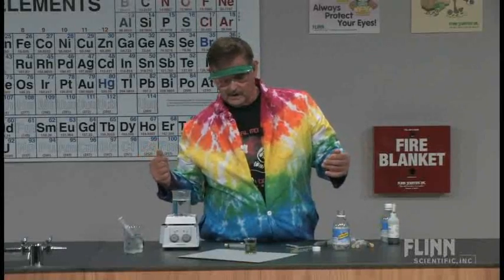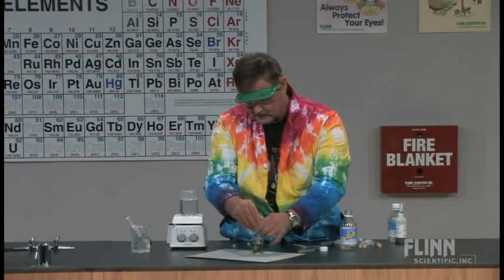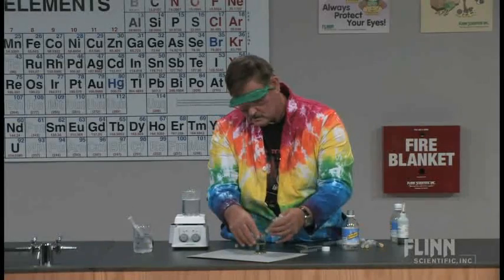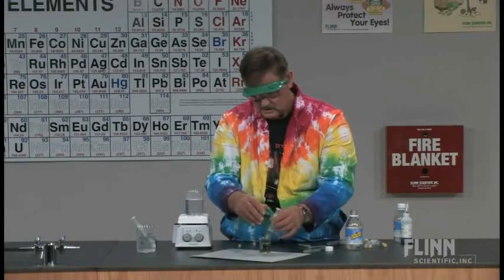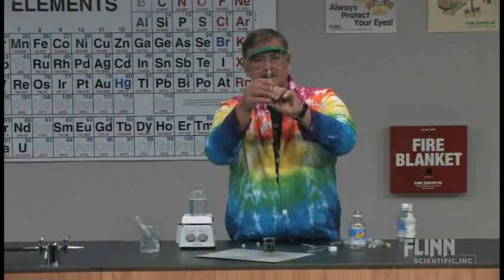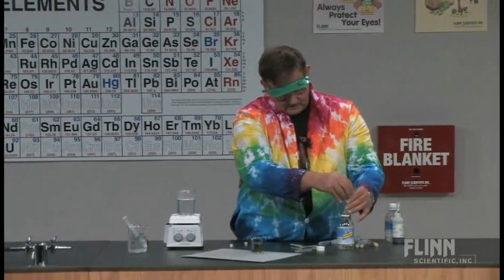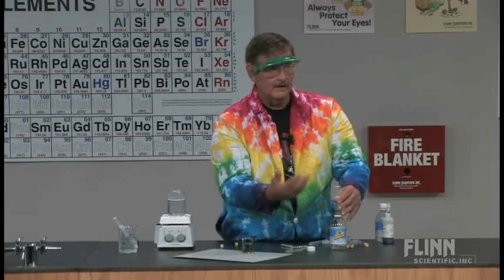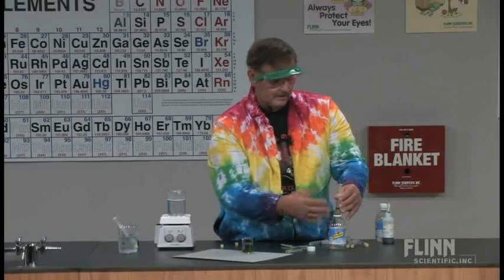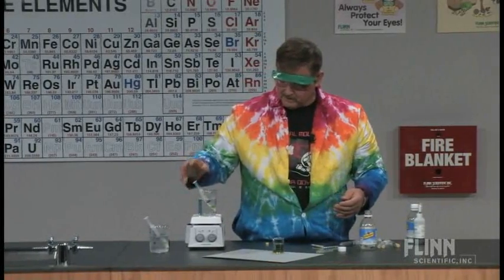If I were doing this with my higher level students in my honors class, I would have them do a series of hot water baths and ice baths at different temperatures. So now I've got hot water here - do the same thing, add a couple of milliliters. If you have a little bit of headspace at the top, just carefully push on the plunger. We'll draw up about three milliliters of carbon dioxide gas. This is continually forming gas inside until it goes flat, and it usually lasts for at least an hour in a period.